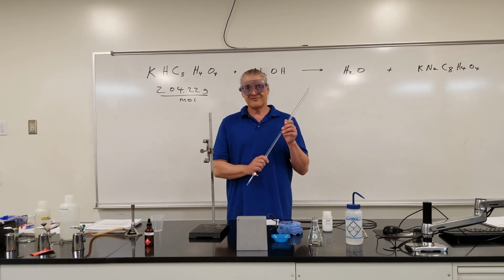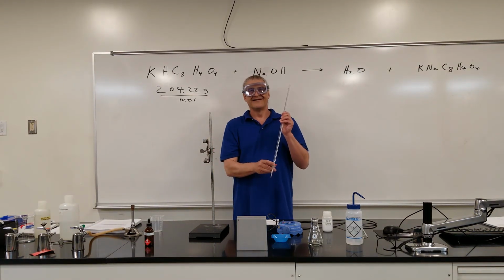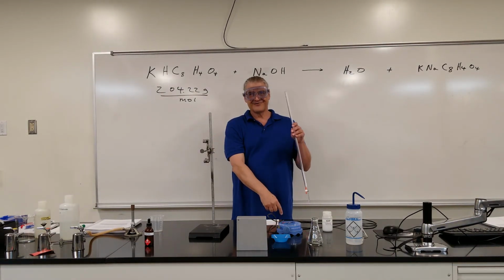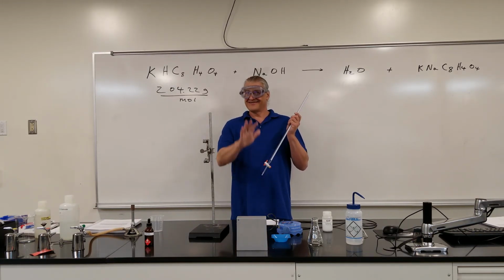Most important thing to know about a burette, when you're filling it, when you're pouring stuff in, make sure it's off. We've all done it before where it's on, you're pouring stuff in, and it's just not filling up because it's dribbling all over your leg. But none of you are going to do that today because this is just a demo.